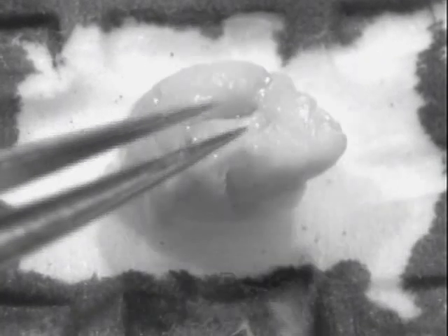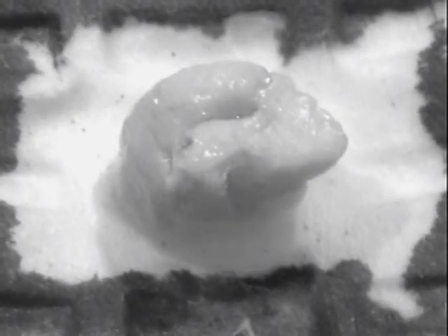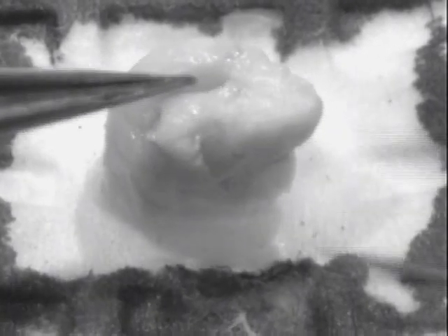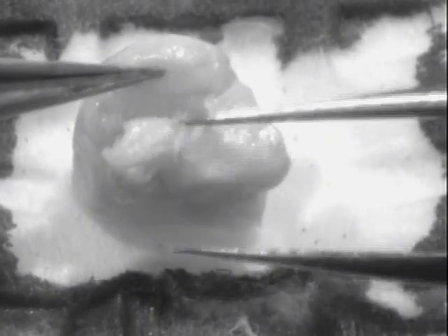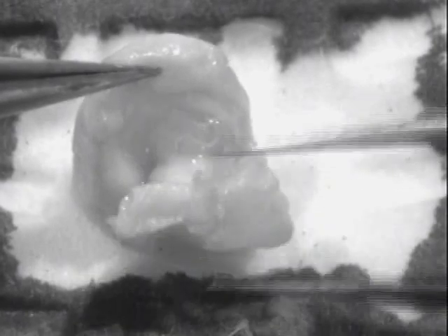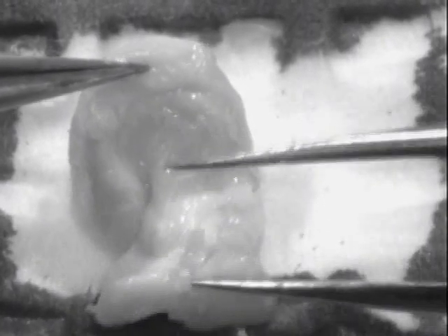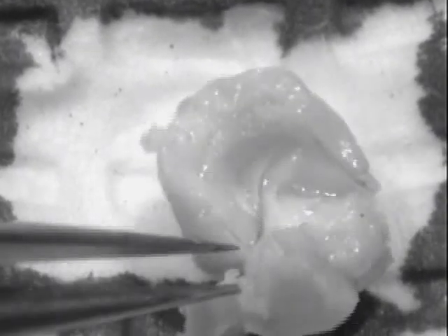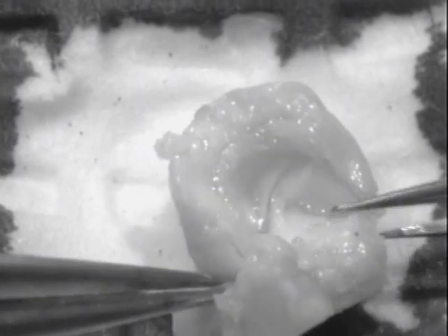Now the caudal part of the brain is pointing up in the air, and you're looking at the cortex on the top and the midbrain on the bottom. I'm just going to peel those midbrain and thalamic structures out of the cortex to separate them away from the hippocampus and cortex.